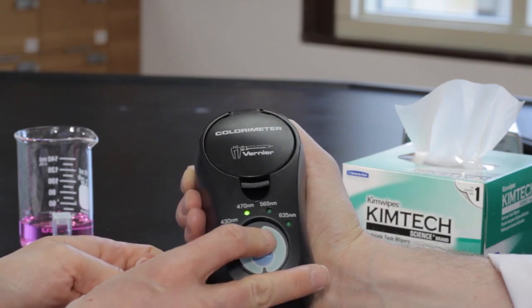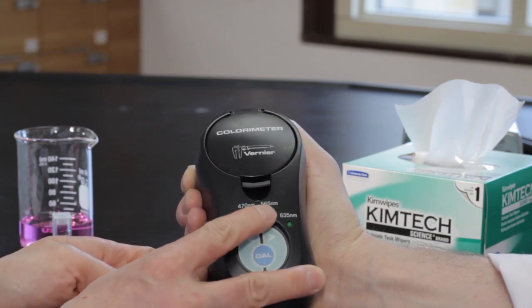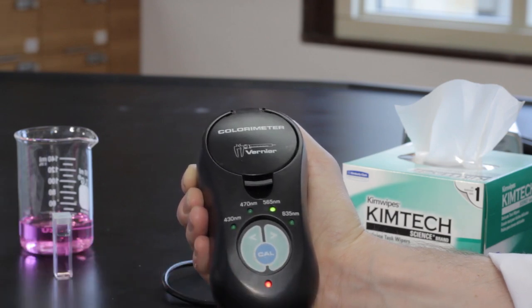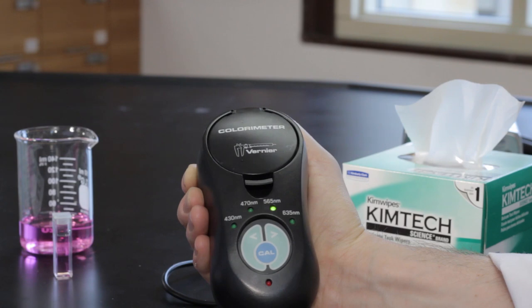On the colorimeter, use the two arrows to set the light wavelength to 565 nanometers. Press the Cal button and a red light will blink 10 times. The colorimeter has now been calibrated.